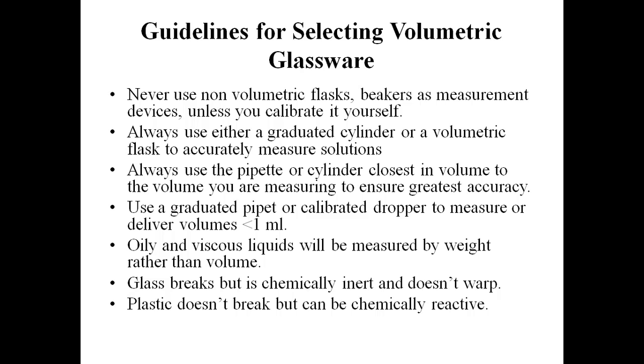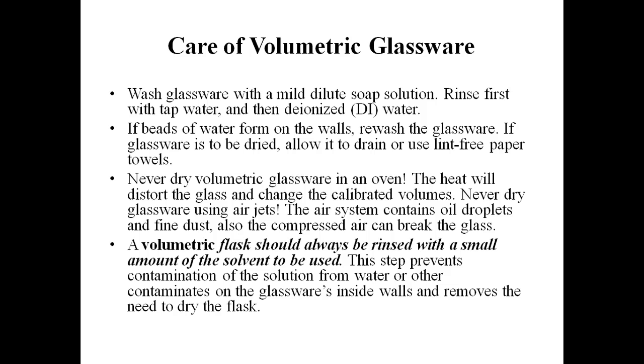This means you cannot measure oily or viscous liquids by pipettes or volumetric flasks. If you want to use these oily and viscous liquids, then the better choice is to weigh them in a suitable glass container. Glass breaks, but it is chemically inert and doesn't warp, whereas plastic doesn't break but can be chemically reactive. Now let's come to the last heading of this topic: care of volumetric glassware.